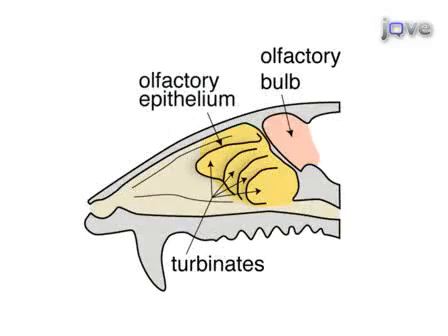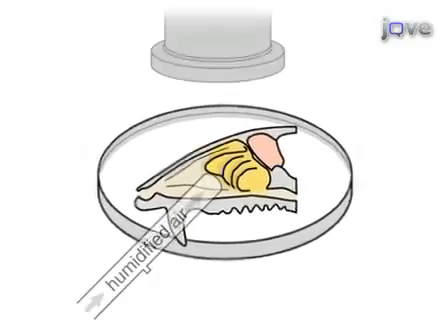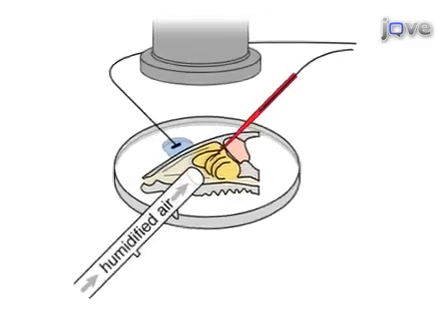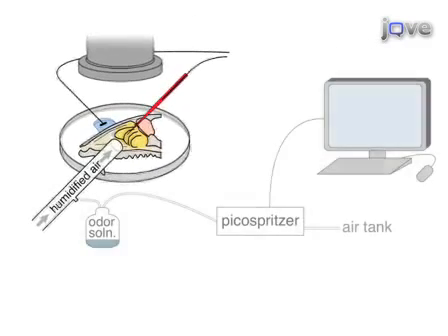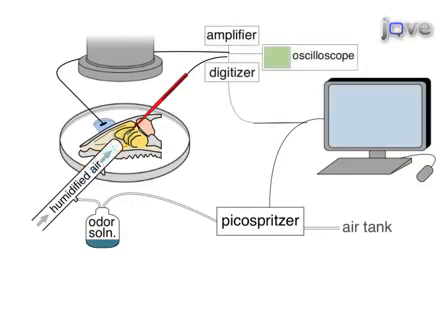A preparation of olfactory epithelium is mounted on a dish and placed into a stream of humidified air under a dissecting microscope. A reference electrode is electrically connected to the tissue through a buffer solution. A recording electrode is placed on the surface of the olfactory epithelium. The olfactory epithelium is stimulated by computer-controlled odorant puffs administered into a stream of humidified air, which carries the odorants to the olfactory epithelium. EOG signals are transmitted through an amplifier and digitizer to the recording computer.